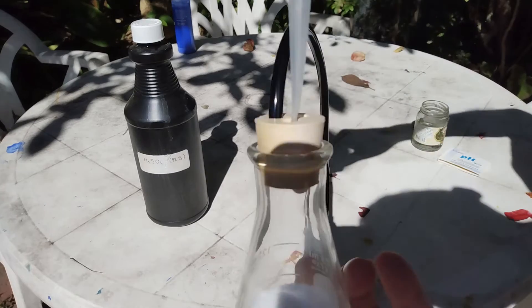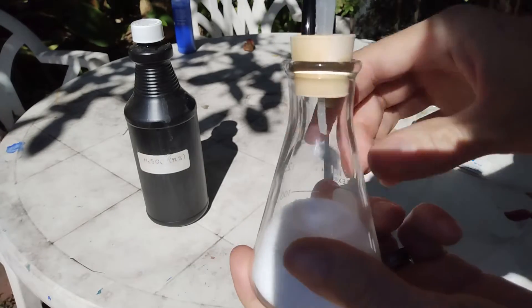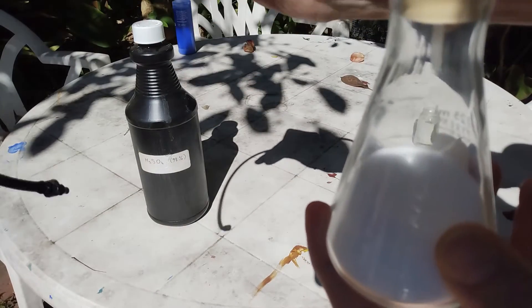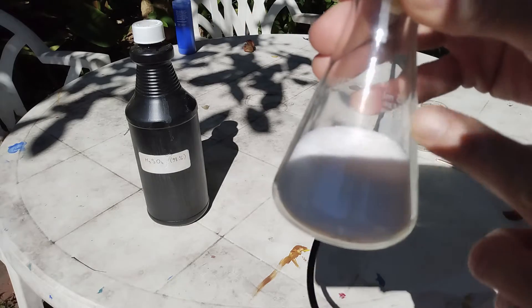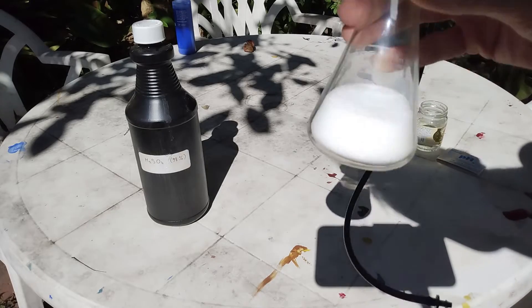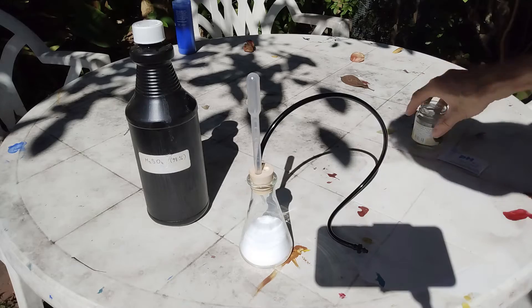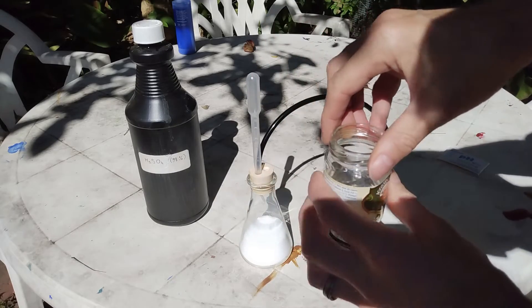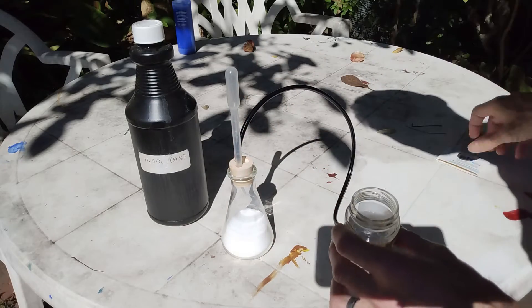Make sure when you put the pipette that it is sealed so that no gas can escape except via this hose. When the sulfuric acid enters in contact with the salt, it will generate HCl gas, and we are going to bubble this gas into this water and it will turn into liquid hydrochloric acid.